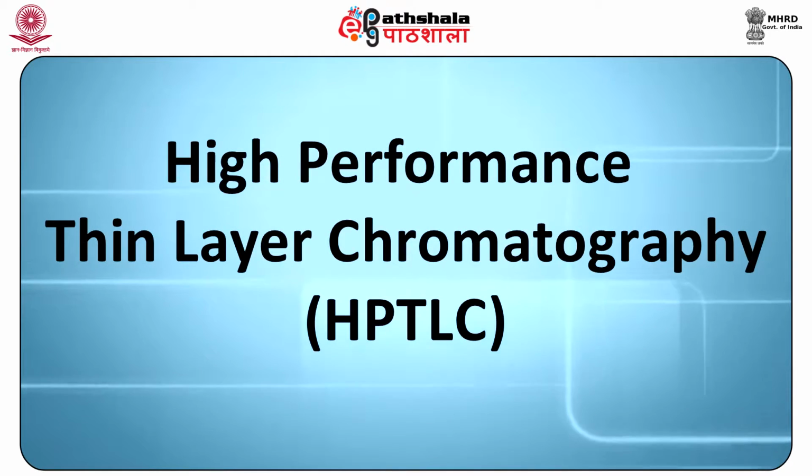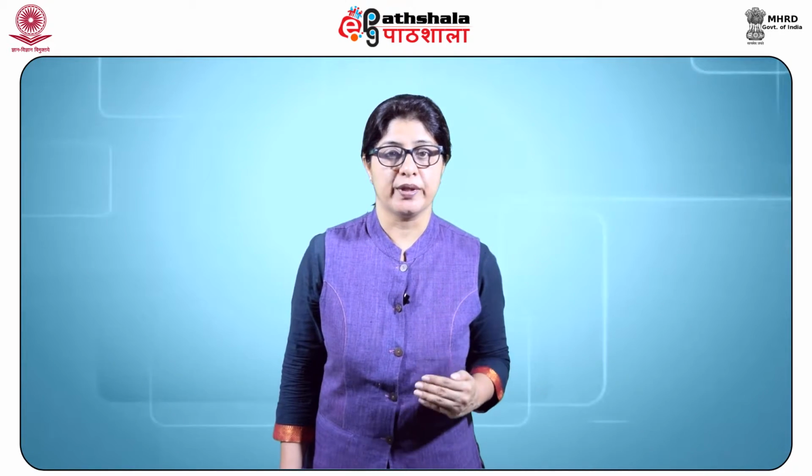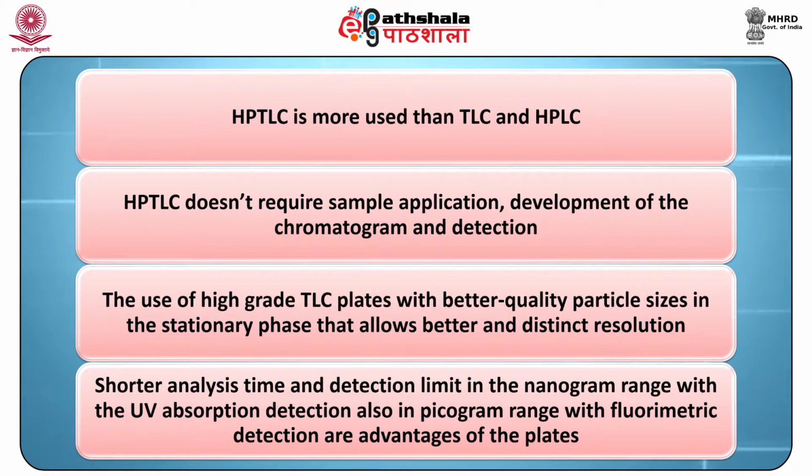High performance thin layer chromatography, also termed HPTLC. HPTLC is an organized and automated form of thin layer chromatography with improved and unconventional separation and detection parameters. It is also known as high pressure thin layer chromatography, planar chromatography or flat bed chromatography. Nowadays, HPTLC is more used than TLC and HPLC because HPTLC does not require manual sample application, development of the chromatogram and detection and so on.